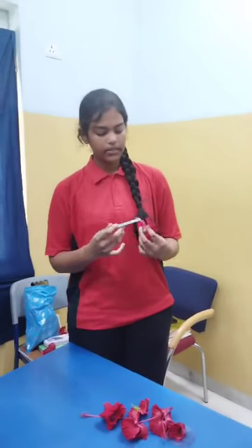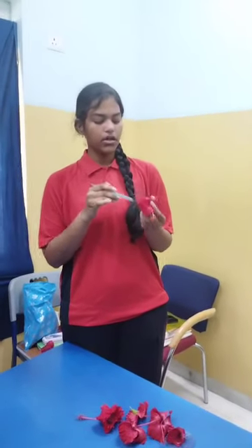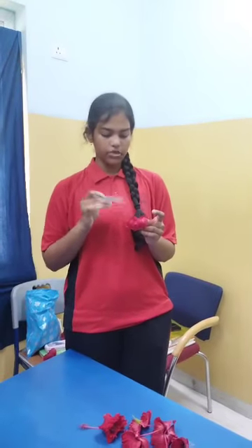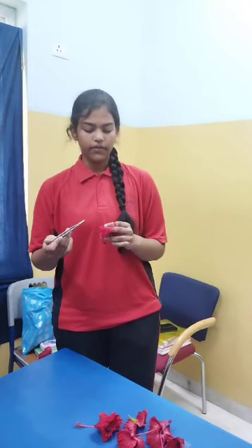As we can see here, in this state the calyx is under the corolla, and we are not able to know whether the petals are gamopetalous or polypetalous. So by doing this activity, we are able to understand the different parts more carefully, and the role of the different parts of the flower.